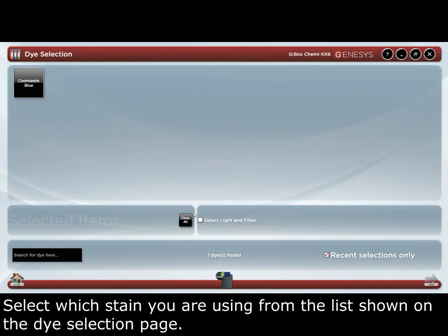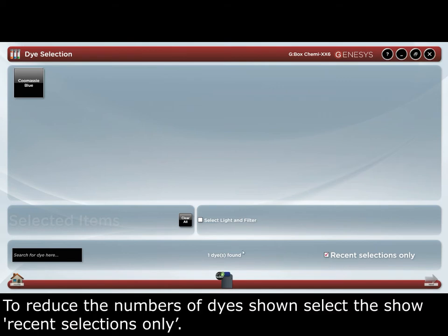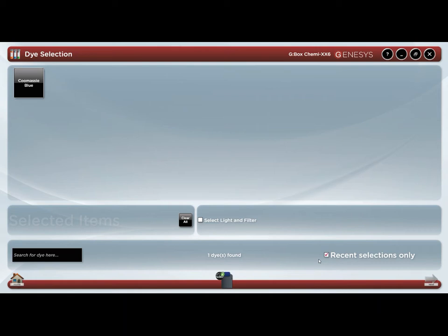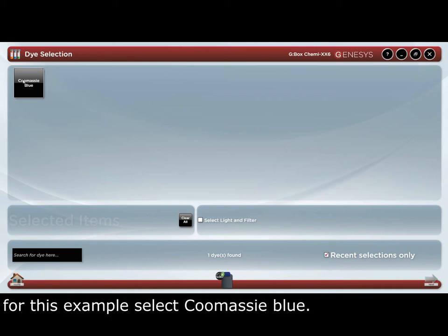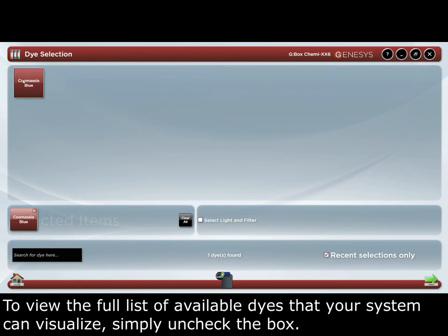Select which dye you're using from the list shown on the dye selection page. To reduce the number of dyes shown, select show recent selections only. For this example, select Coomassie Blue. To view the full list of available dyes that your system can visualise, simply uncheck this box.